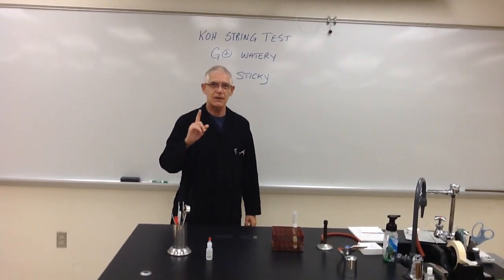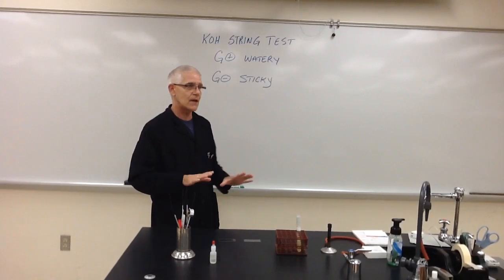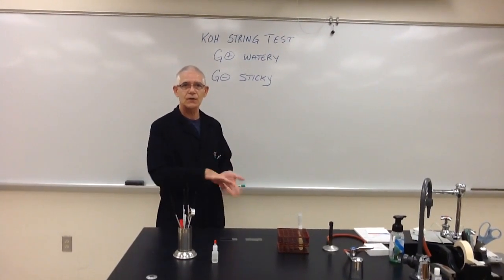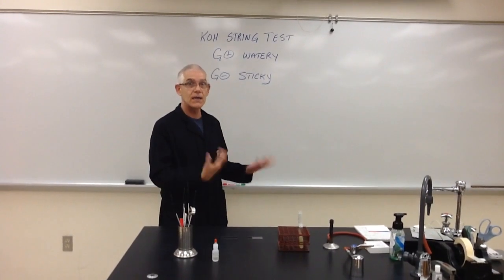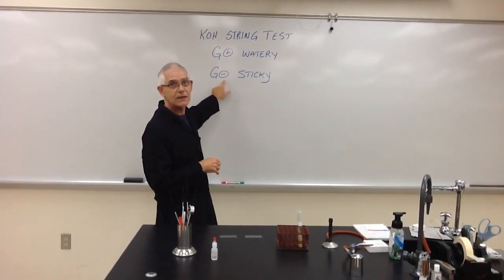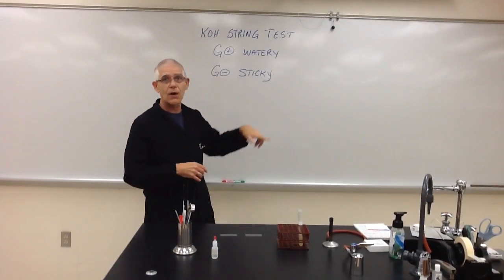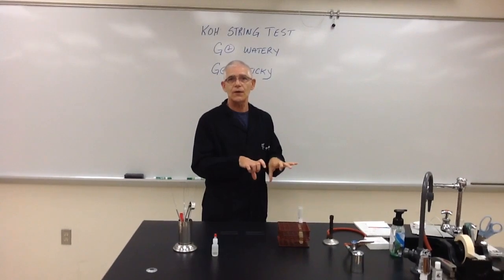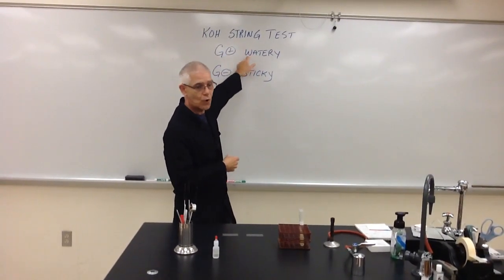Hi everybody, today we're going to do the KOH string test. The theory behind this is that for the gram-negative bacteria, the KOH that we're going to use is going to break down the outer membrane and cell wall, and it will release DNA, and what that's going to do is make gram-negative sticky. With the gram-positive bacteria, however, you've got a thick peptidoglycan layer, so that's not going to break down. Therefore, gram-positive will be watery.